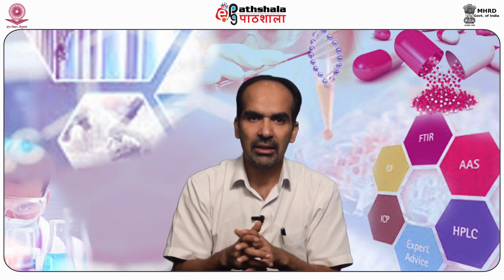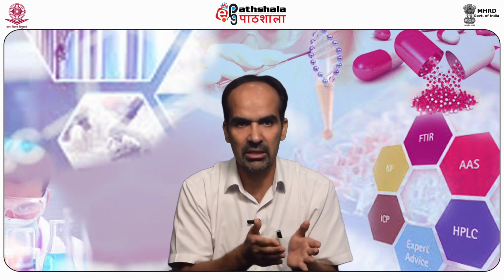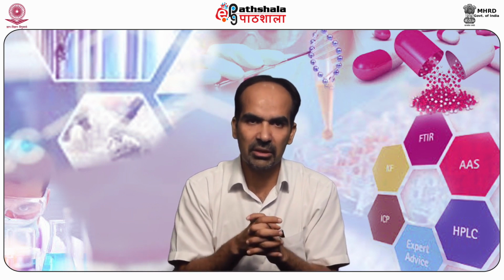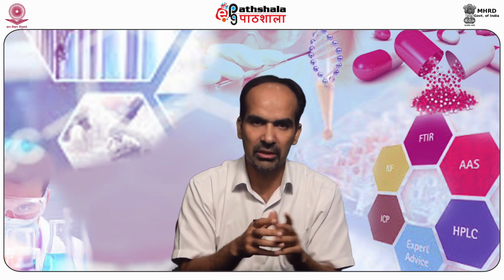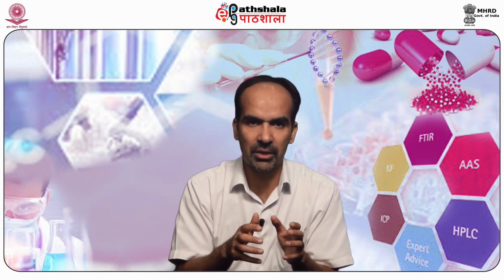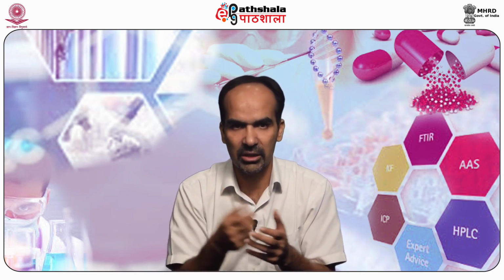Number 1, alkaloids are usually sparingly soluble in water but readily soluble in non-polar organic solvents like ether, chloroform, benzene and light petroleum. The second property is that alkaloids combine with acids to form salts. These salts are usually freely soluble in water but only sparingly soluble in organic solvents like ether and chloroform.